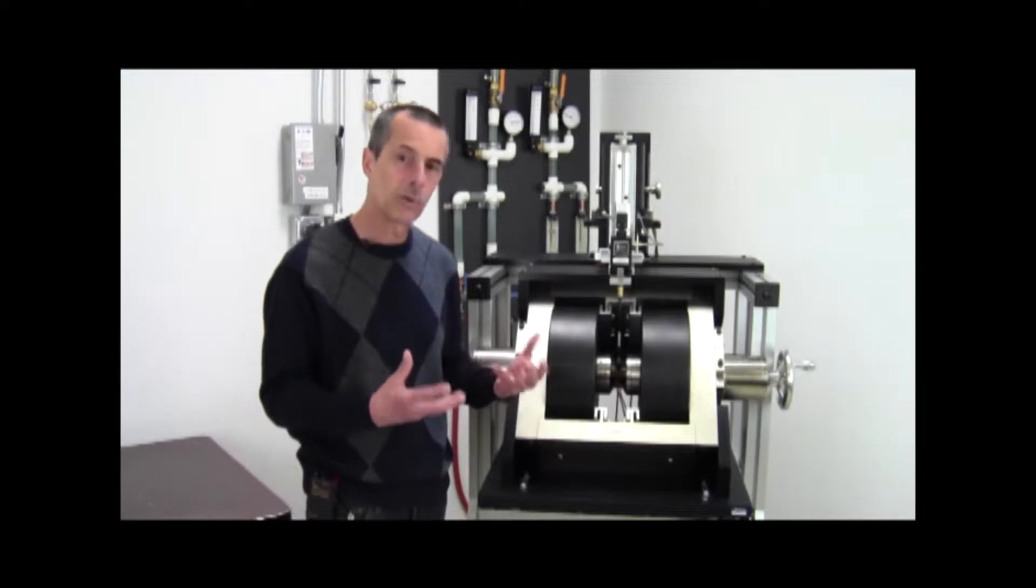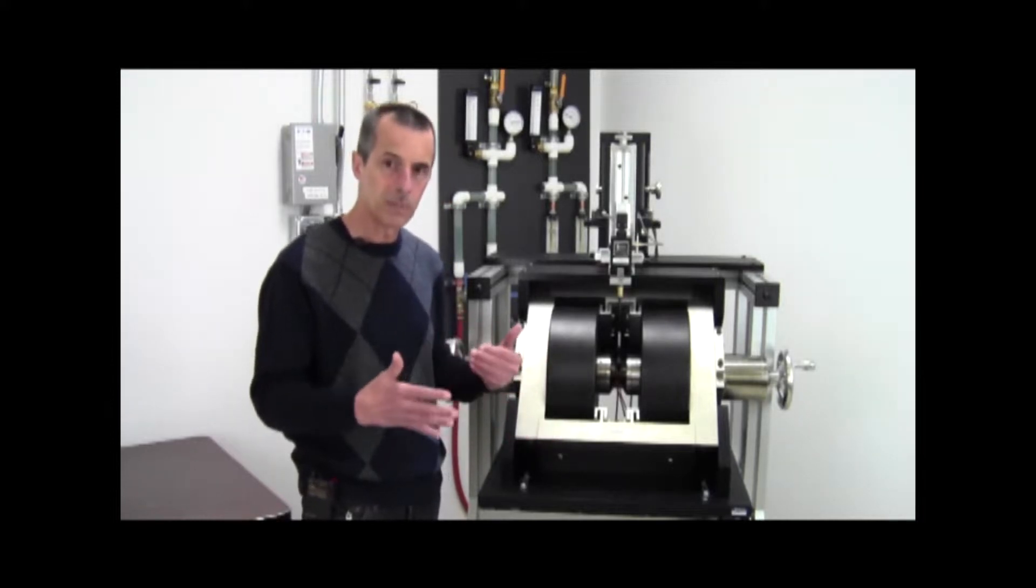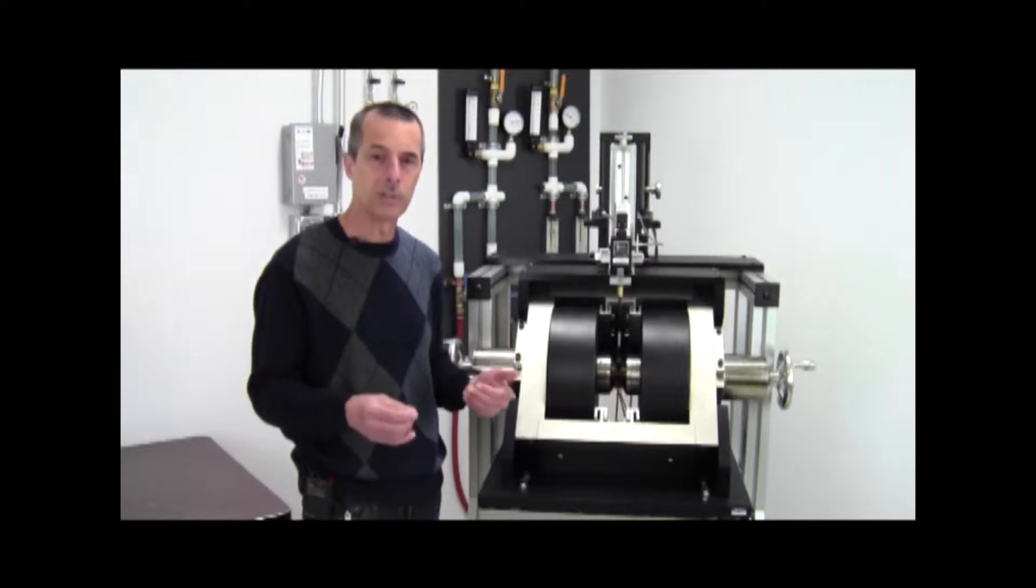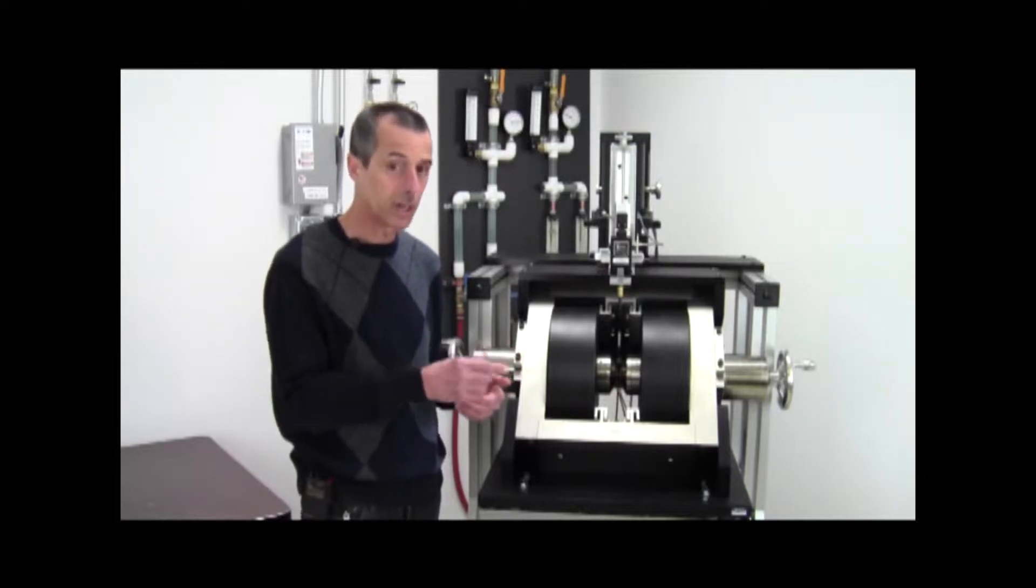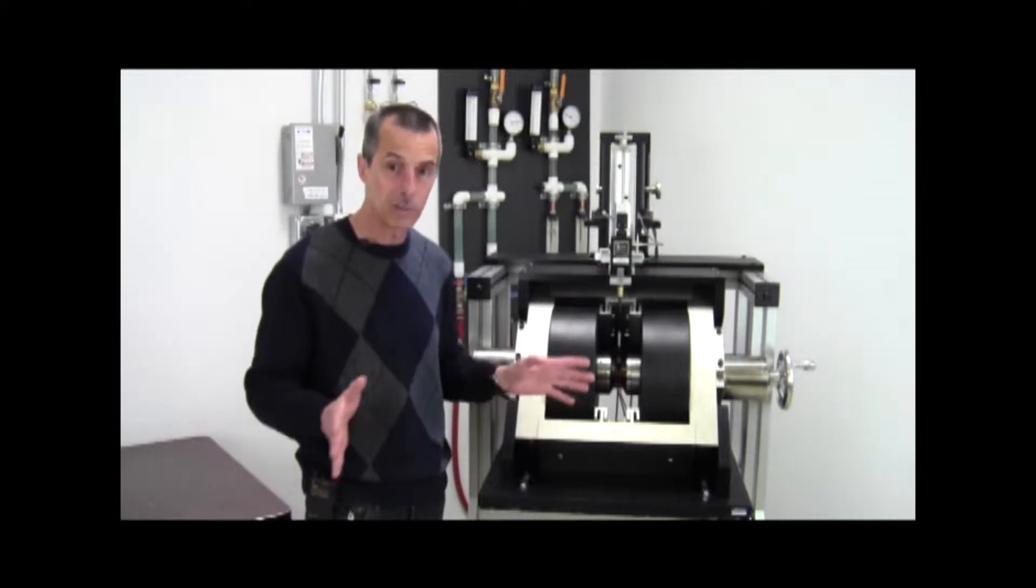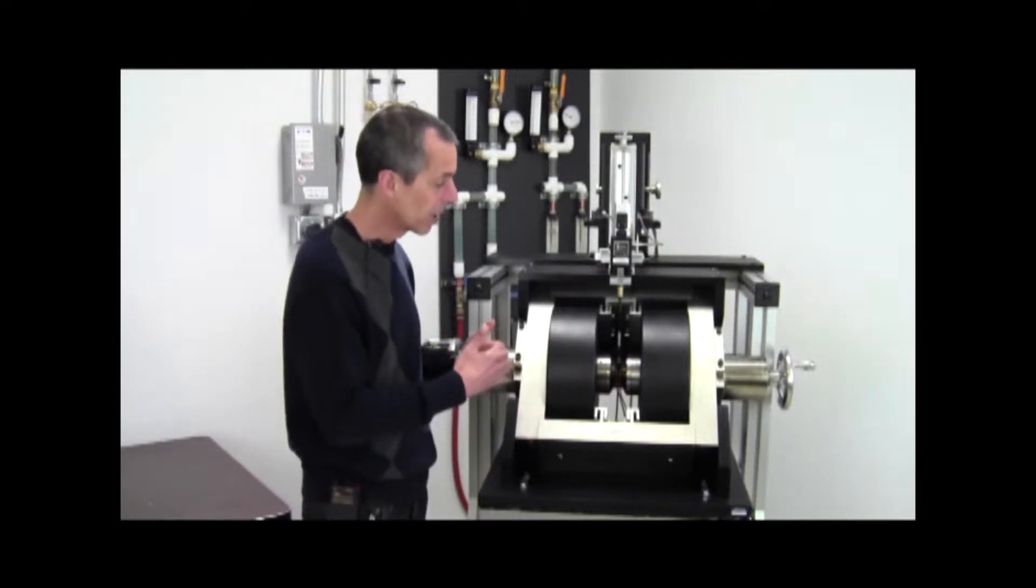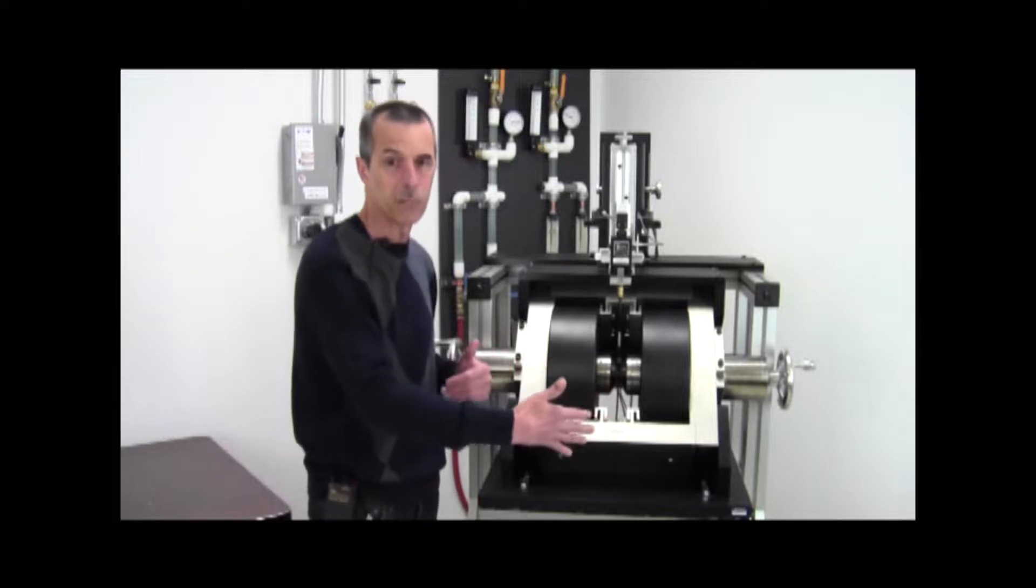And because of field ramping algorithms that have been implemented in combination with the ability to record data at very short time constants, as low as 10 milliseconds, one can acquire data very quickly. In fact, one can acquire a full hysteresis loop over the full field range of the magnetometer in as little as seconds.